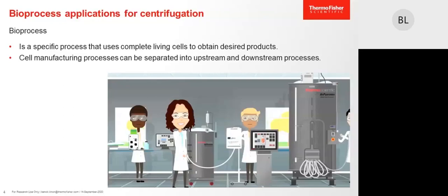Then this product is collected, harvested, clarified, and purified to remove all the contaminants and to obtain a pure biological product of interest. So the bioprocess is the workflow to obtain this product of interest for therapeutic means or other means.